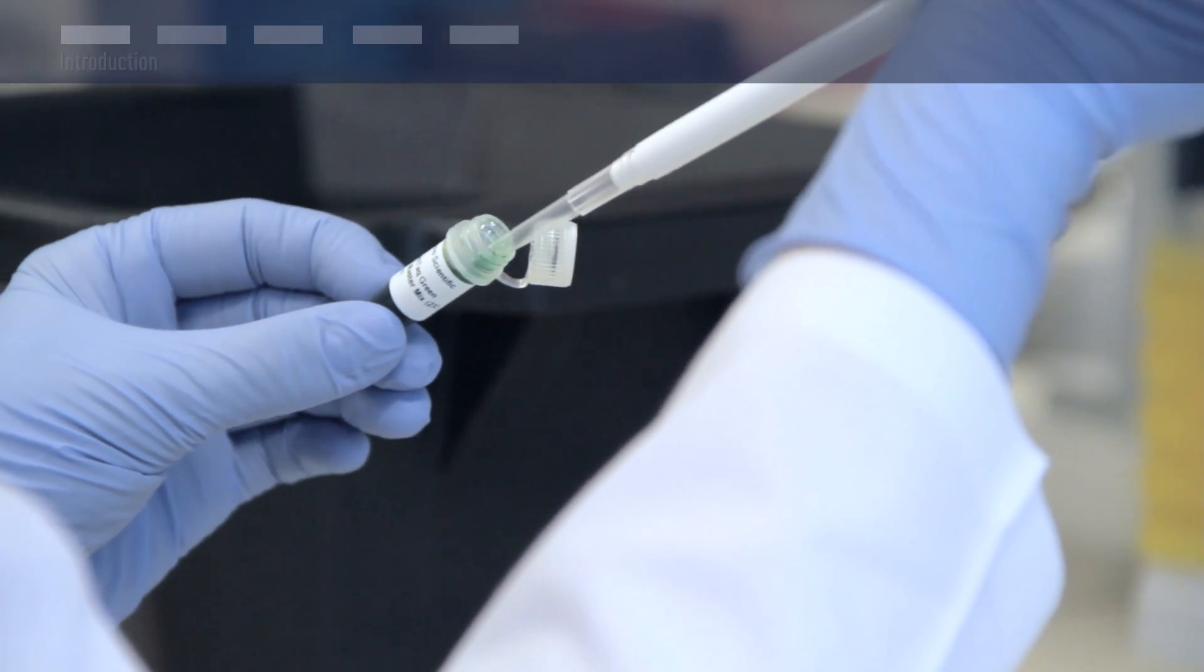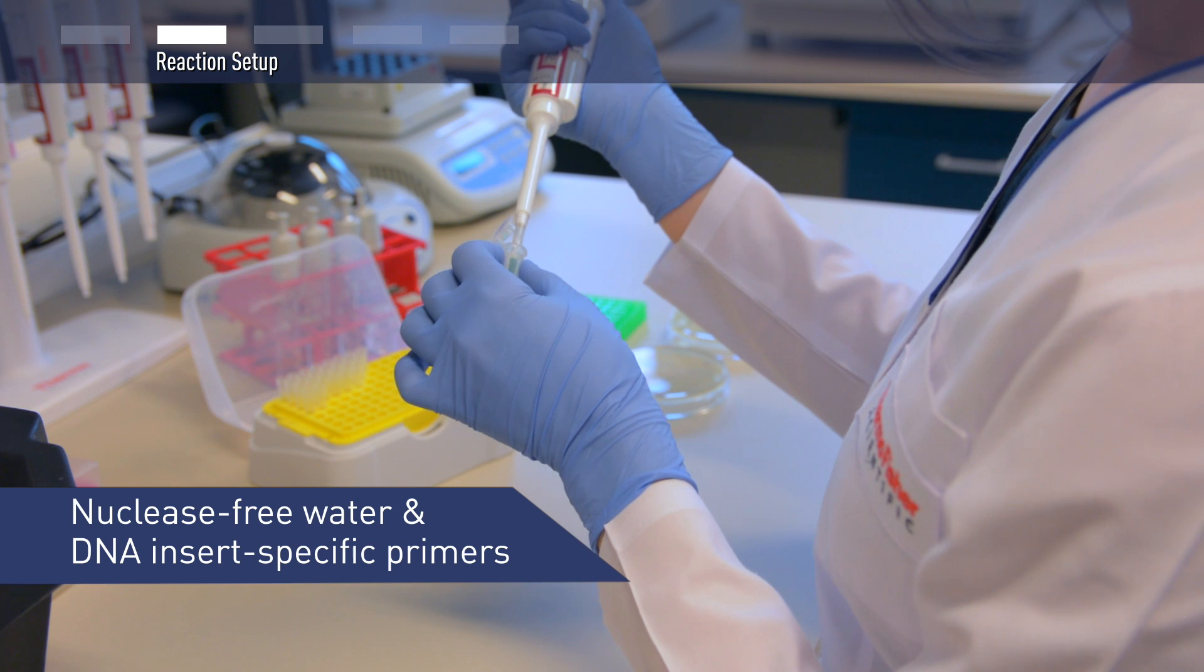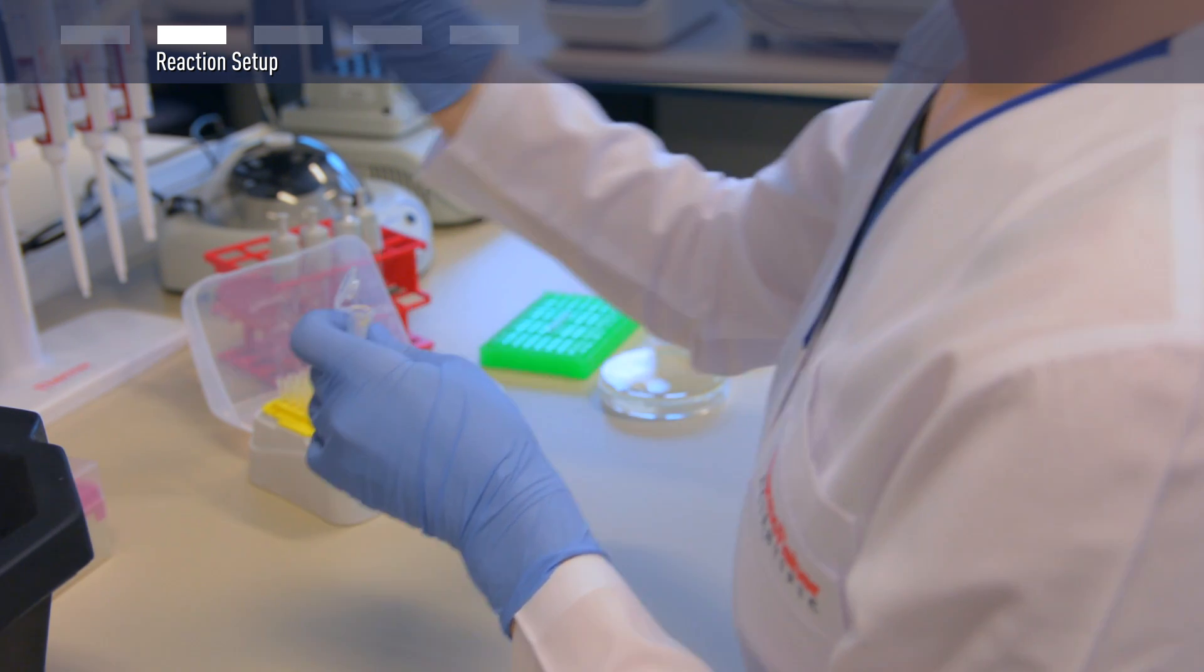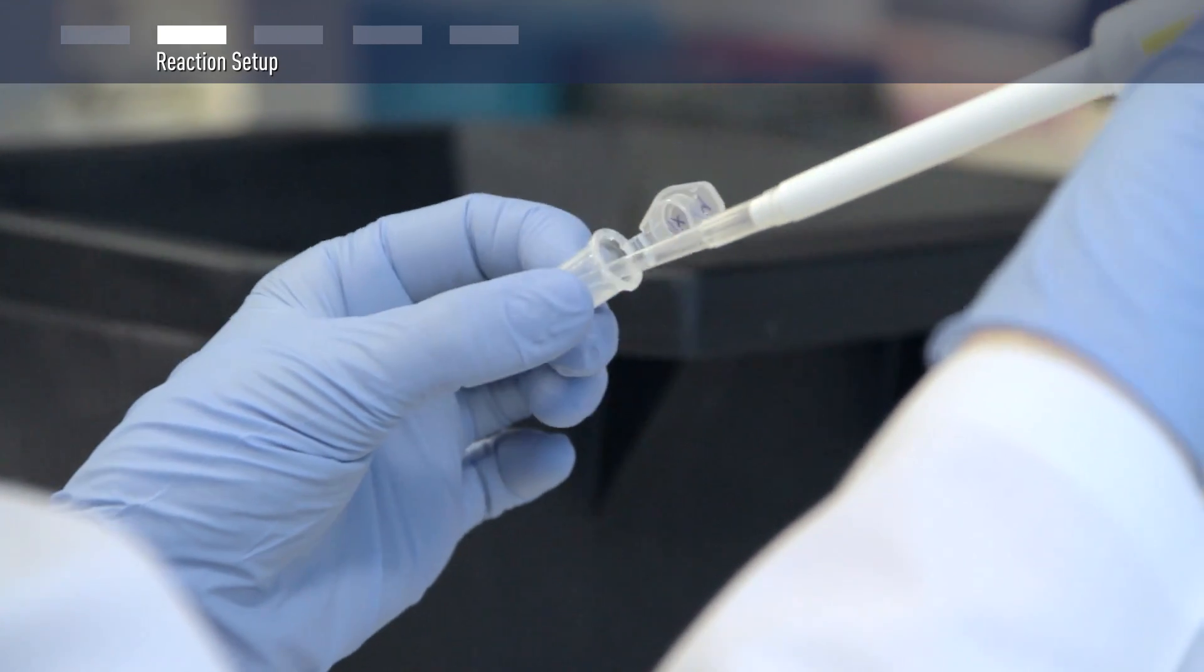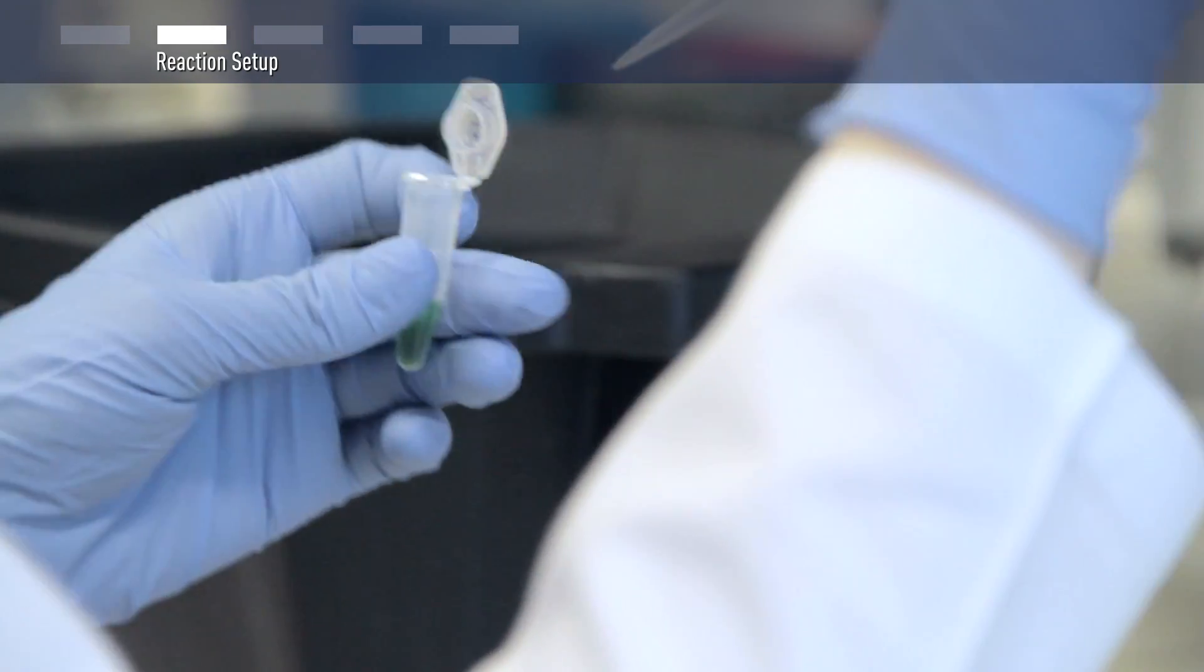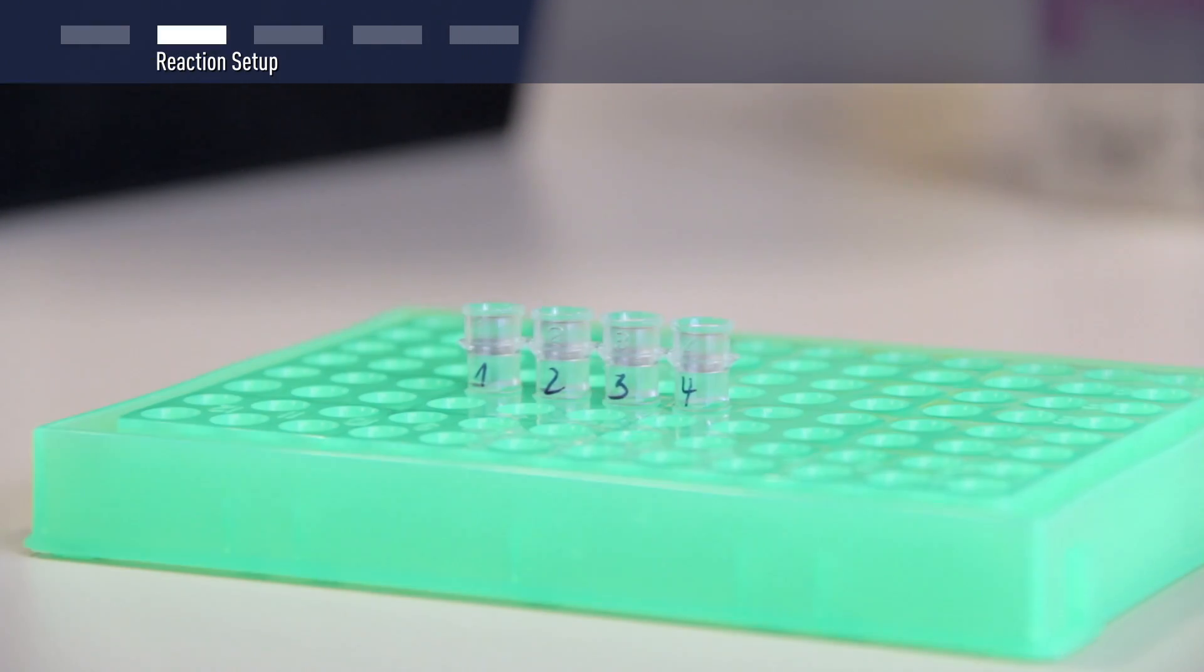To prepare your one-time PCR MasterMix, add nuclease-free water and DNA insert-specific primers to two-times DreamTaq PCR MasterMix. Make sure to prepare enough one-time PCR MasterMix for all reactions. Aliquot 50 microliters of the one-time PCR MasterMix into each PCR tube.